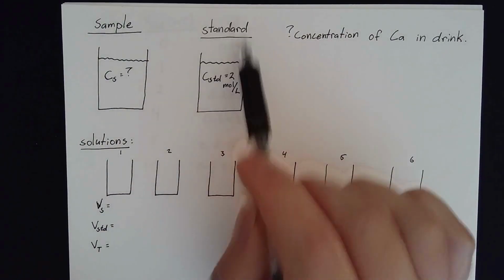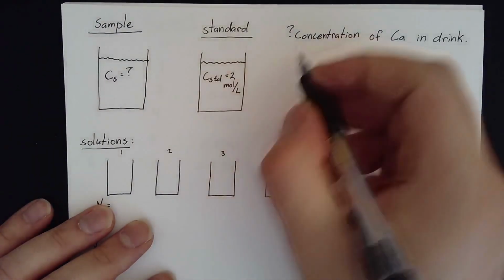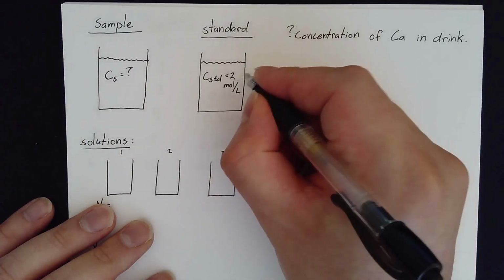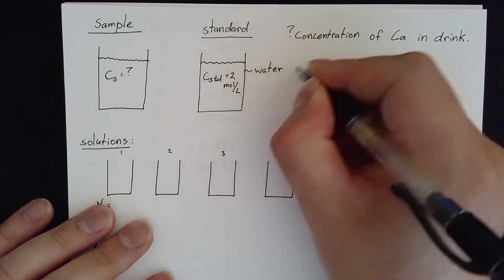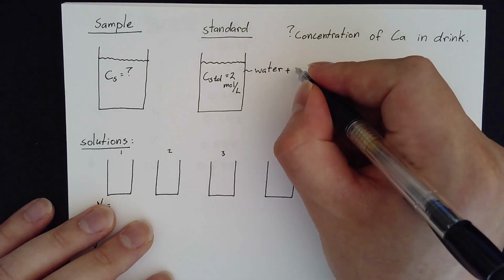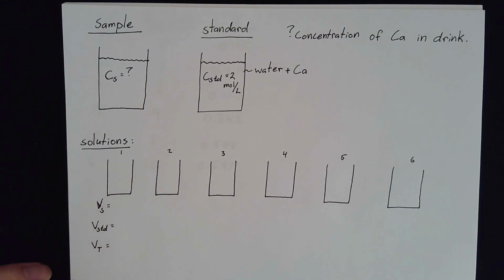Then we've made a standard solution. Maybe we made it by taking some calcium. We made it somehow or other, and that's just going to be a solution of water plus calcium. Okay, that's all that is.